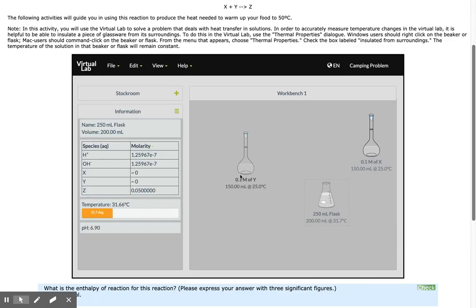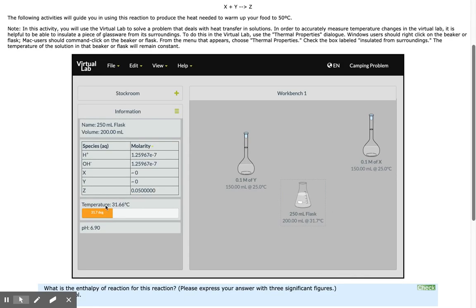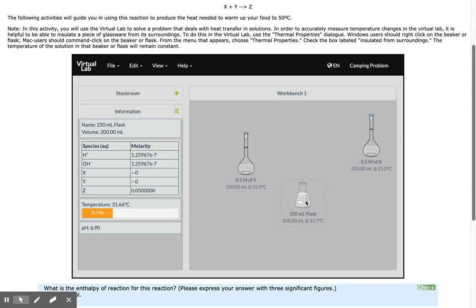As you can see, the temperature has increased. When temperature increases, this indicates an exothermic reaction because it released heat energy to the surroundings.